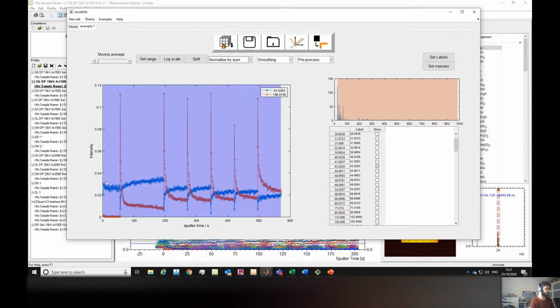So you can see it kind of corrects for some features, right? So it's better to compare. Another useful one, when you only have like 2-3 peaks of interest, is to normalize by the sum of selected. So now it will normalize only by the ones that are shown here in the plot, the ones I selected. So basically, for each level, these have to add up to 100%, the blue and the red.